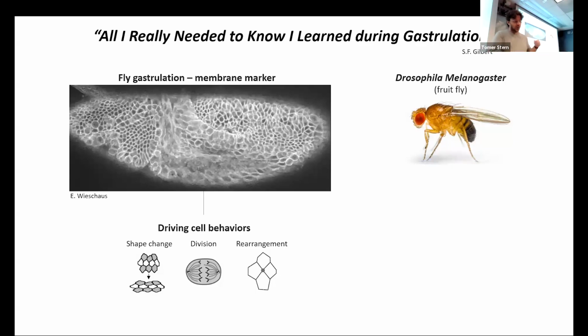Right. So clearly, in order to do this research, we cannot just look at the tissue because it's way too complicated for us. So what we need is to be able to extract from the tissue the shapes of the cells over time, which is what we call segmentation. And we need to also know how to track them over time, to link the same cell within different time points. Now, of course, there are thousands of papers that show how to do that.